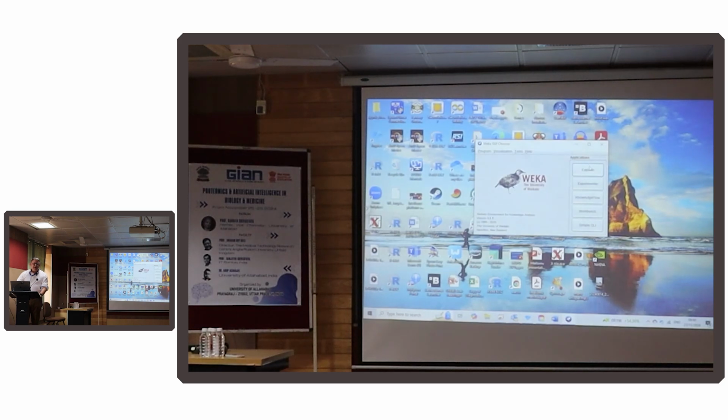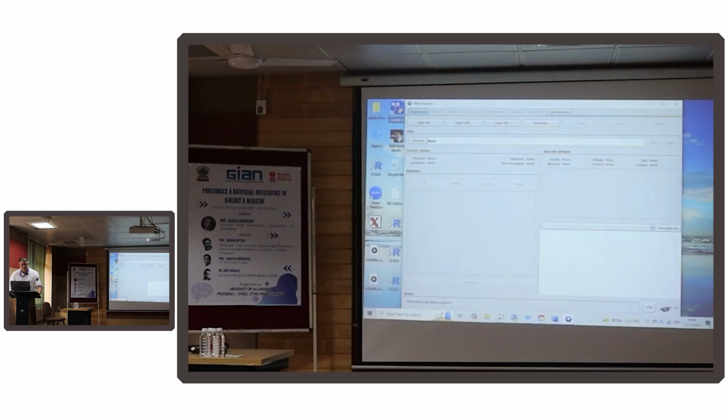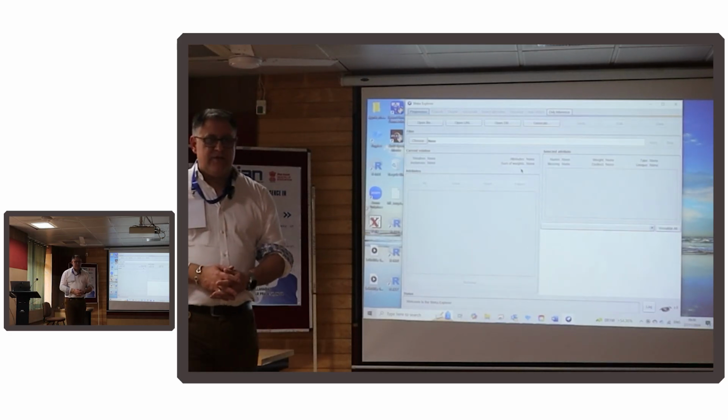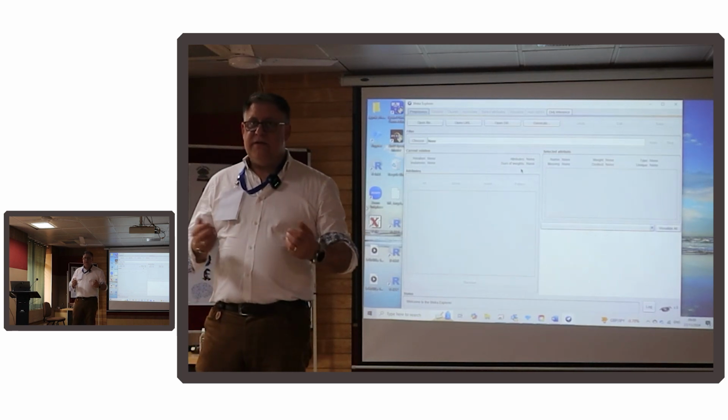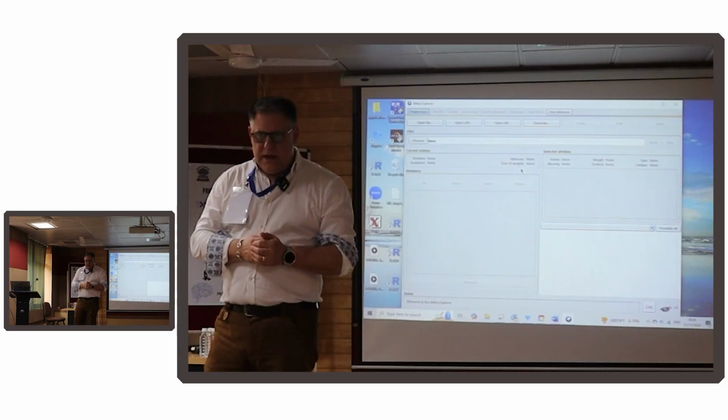I've just been talking about deep learning for J. I've just been talking about AutoWeka as being useful tools to install. So there are various packages or applications within Weka, and they implement machine learning in different ways. So the first one, and the most easy to use and the most commonly used one, is Weka Explorer. And this is a GUI, so it's a graphic user interface. It means you can put things in place, implement solutions, and you don't need to do any coding.